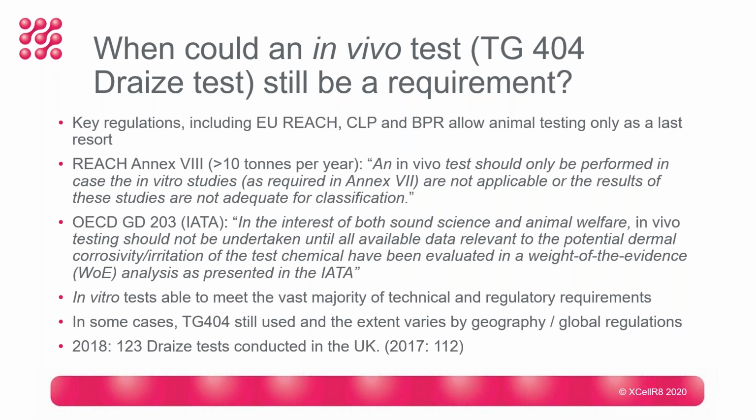So all of these regulatory frameworks are recognising that sometimes in a small number of cases they will still expect an animal test, but this has to be a last resort. And I think that the in vitro methods that are now available are so powerful that those cases where an in vivo test will be needed is minimal.